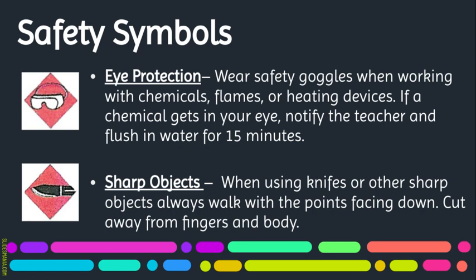notify the teacher immediately. And you and I are going to walk over to the eye wash and we are going to flush your eye out for about 15 minutes. The eye wash is on the side right near the shower. There's a little handle. We just pull it out, and there's a little contraption that kind of unfolds, and the water starts trickling out just like a water fountain.